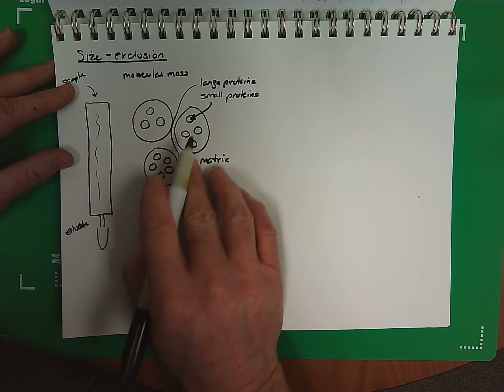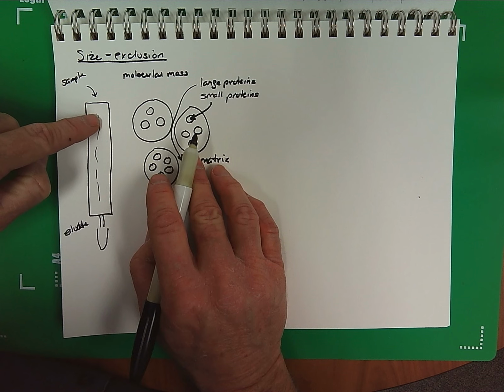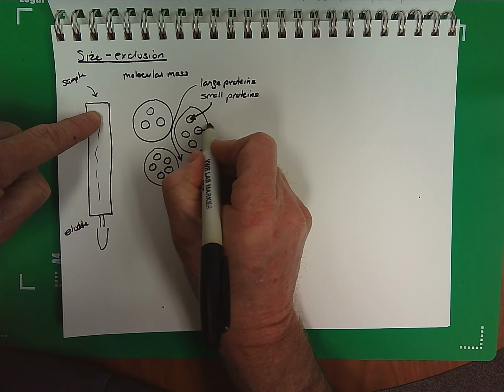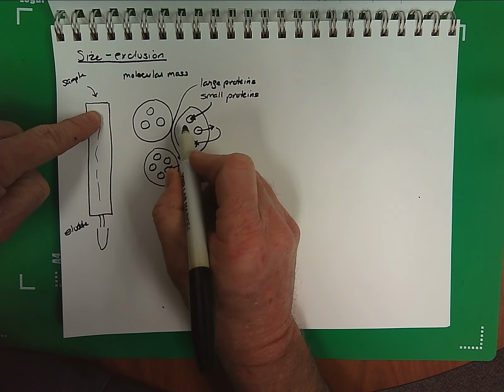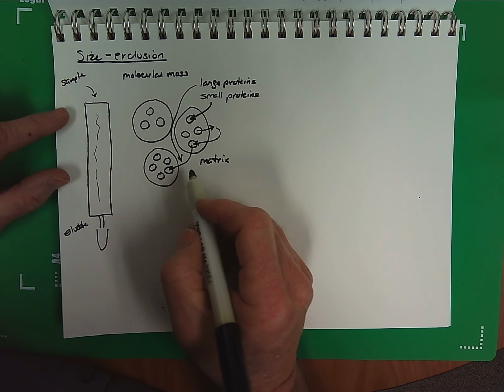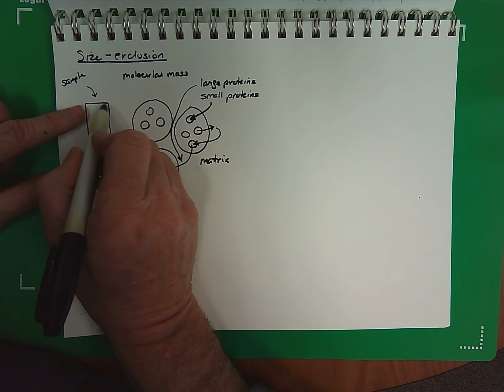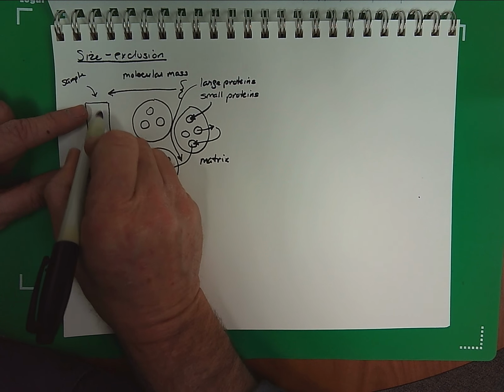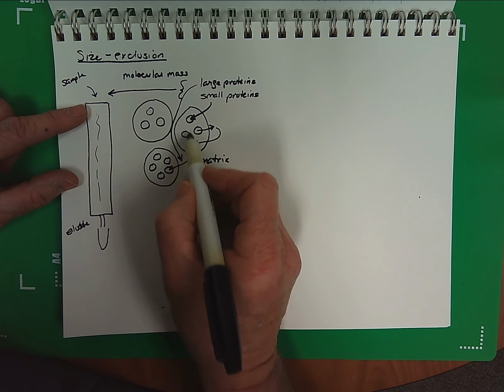Now imagine a lot of these matrix beads in this column, and as small proteins are percolating through the column, they are entering and exiting these holes. The large proteins are going around these matrix beads. So over time, when you have a mixture of large and small proteins entering the top of the column, the small proteins are going to take longer to go through the column because they're going in and out of these beads.